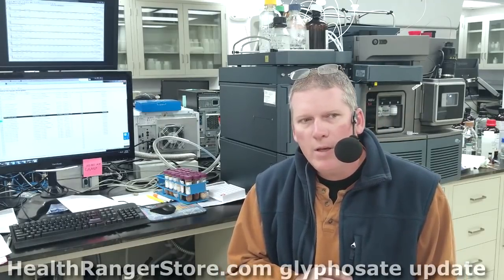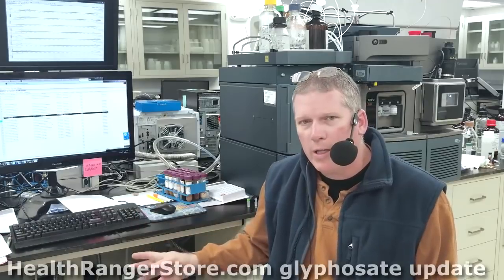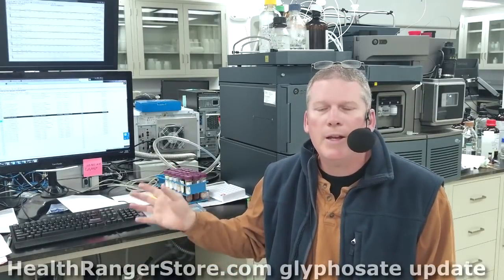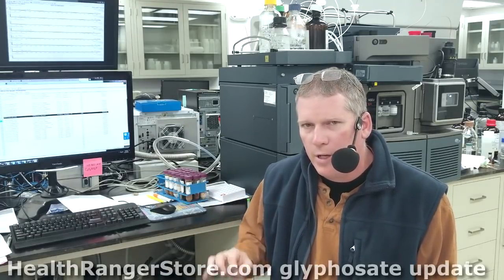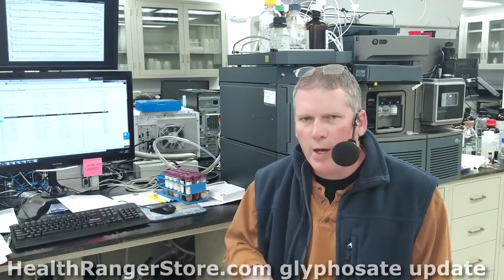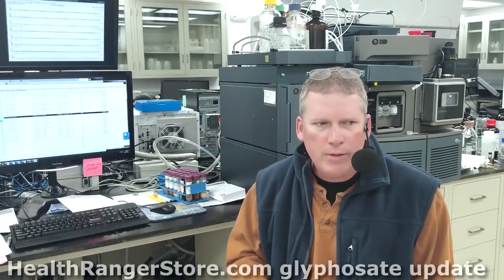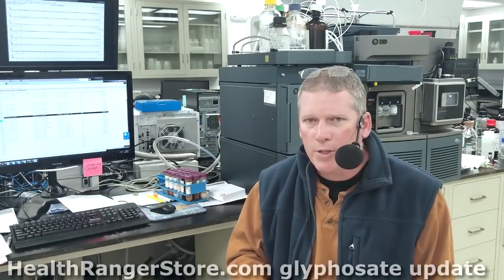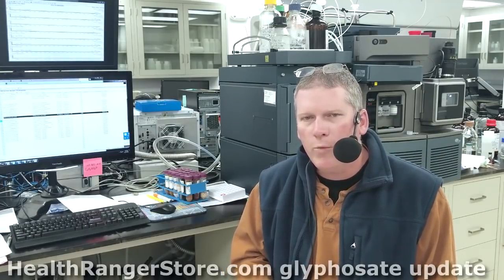You might ask, what's your certainty of your testing method? For those of you who are scientists, we have a multi-point calibration curve with a linear fit over 0.997 coefficient, so it's a near perfect linear fit. We have 2 quadrupoles, so we're filtering the mass to charge ratio of the parent molecule, glyphosate, with negative ionization at 168, and then the glyphosate daughter ion fragment at 63. That's the transition we're using for quant, and then we're using an ion confirmation at 150.